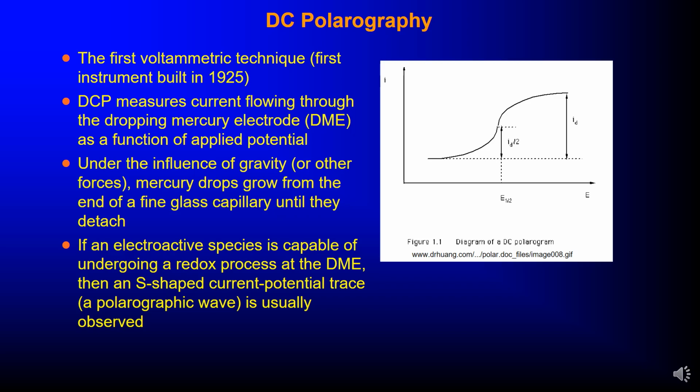It is also used to determine more than one ionic species in solution, but this requires a series of steps of the same form, which occurs when the discharge potential of each species is reached. So it is effective in the determination of very dilute solutions. That's why we talked of trace when we are doing trace analysis.